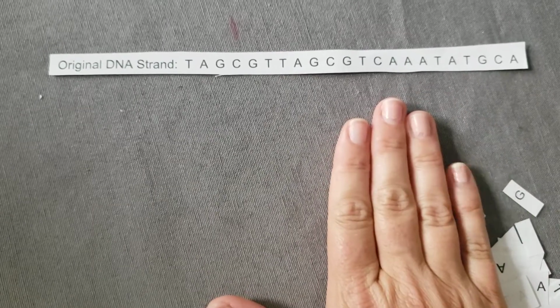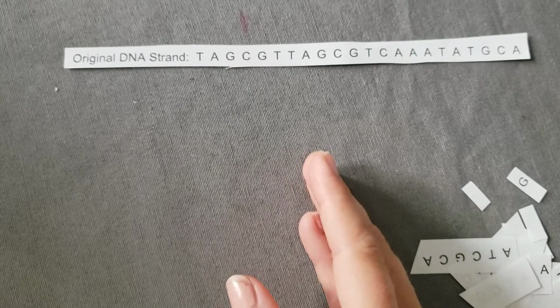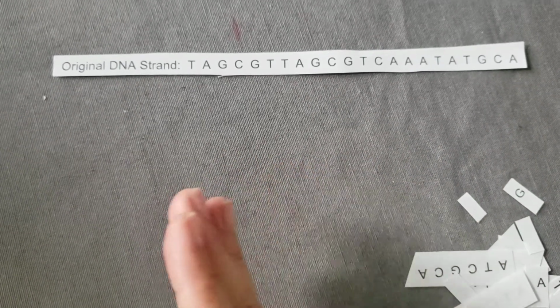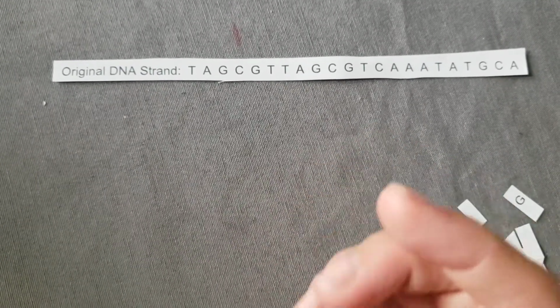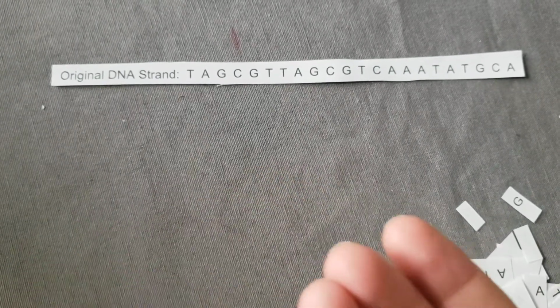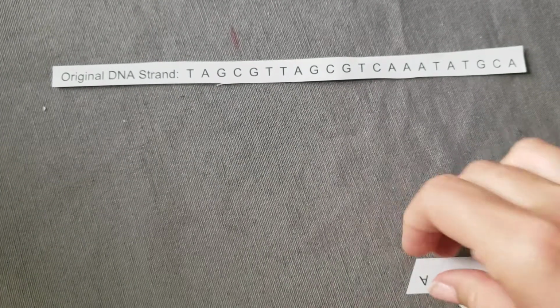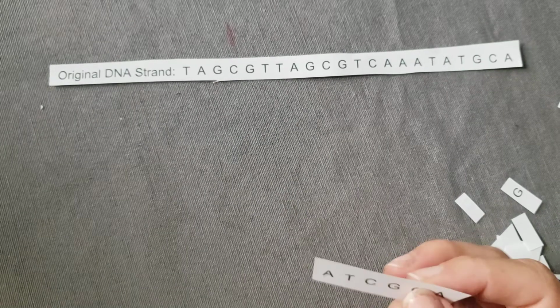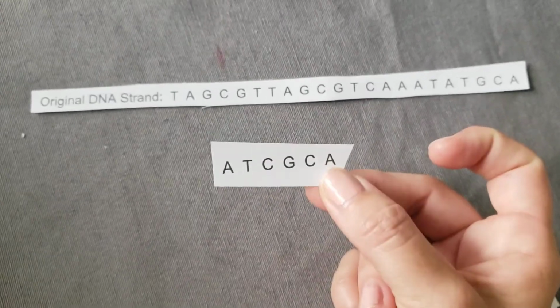Every flu virus is going to be a little bit different from the others, but they do have some DNA that's common to all. In fact, there's quite a bit of DNA that's common to all. That's the case with every organism. And so in that case, we have a region of DNA that would be highly conserved, meaning it's the same from one type of flu virus to the next. So we would take a primer that we know would match to the known portion of the flu virus DNA. And so let's just say that that's this right here.